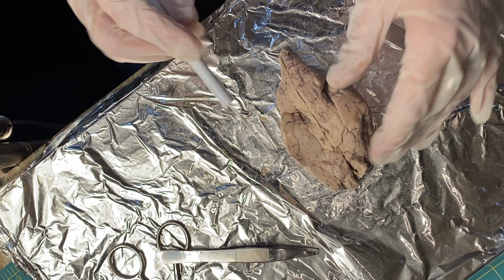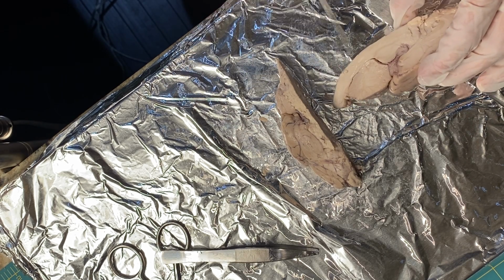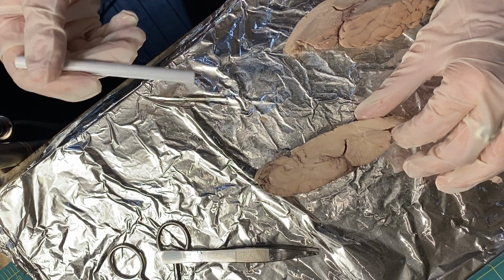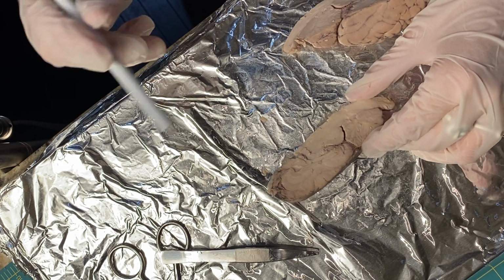I believe I discussed the pons, where they contain tracts that connect. Pons right here and right here. I believe that I said that they contain nerve tracts that connect the cerebellum with the other parts of the spinal cord.